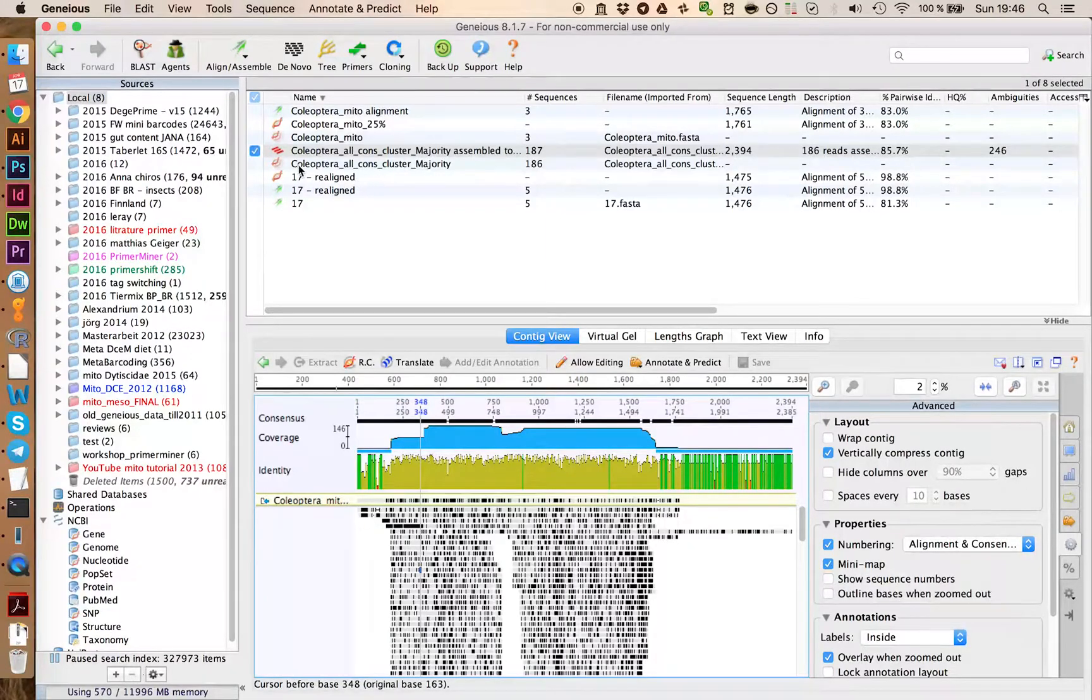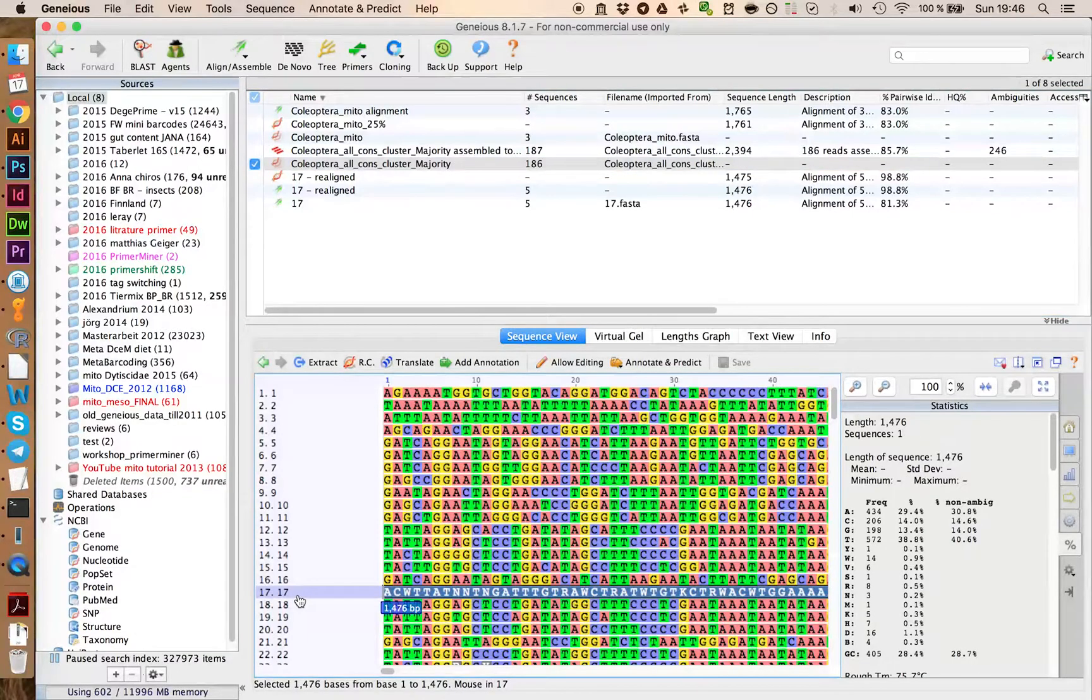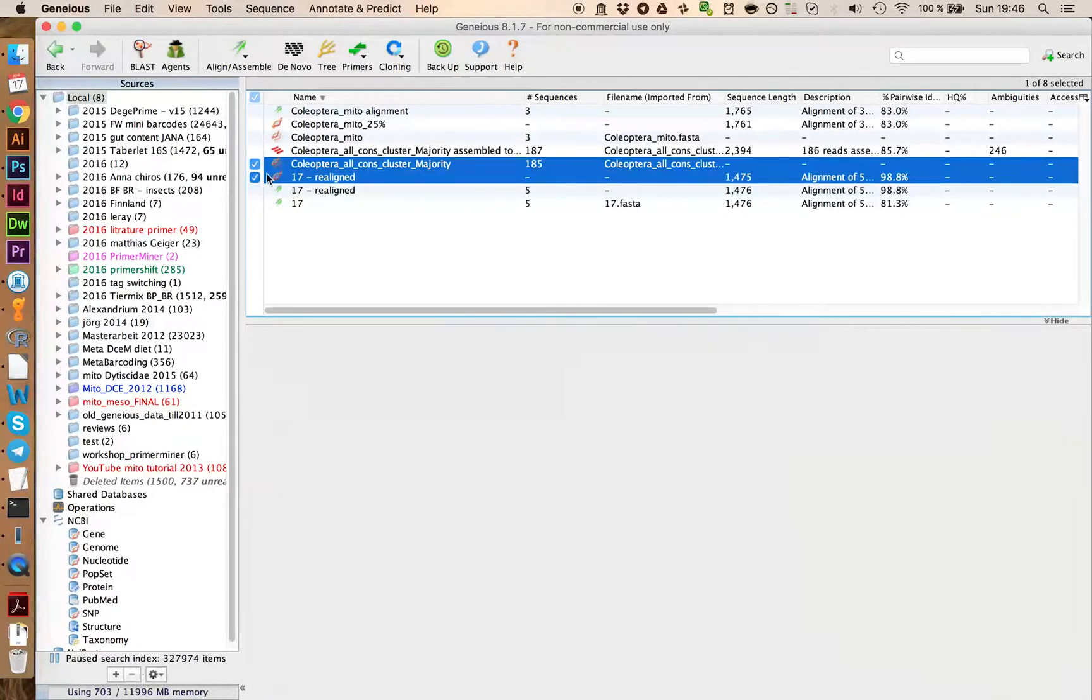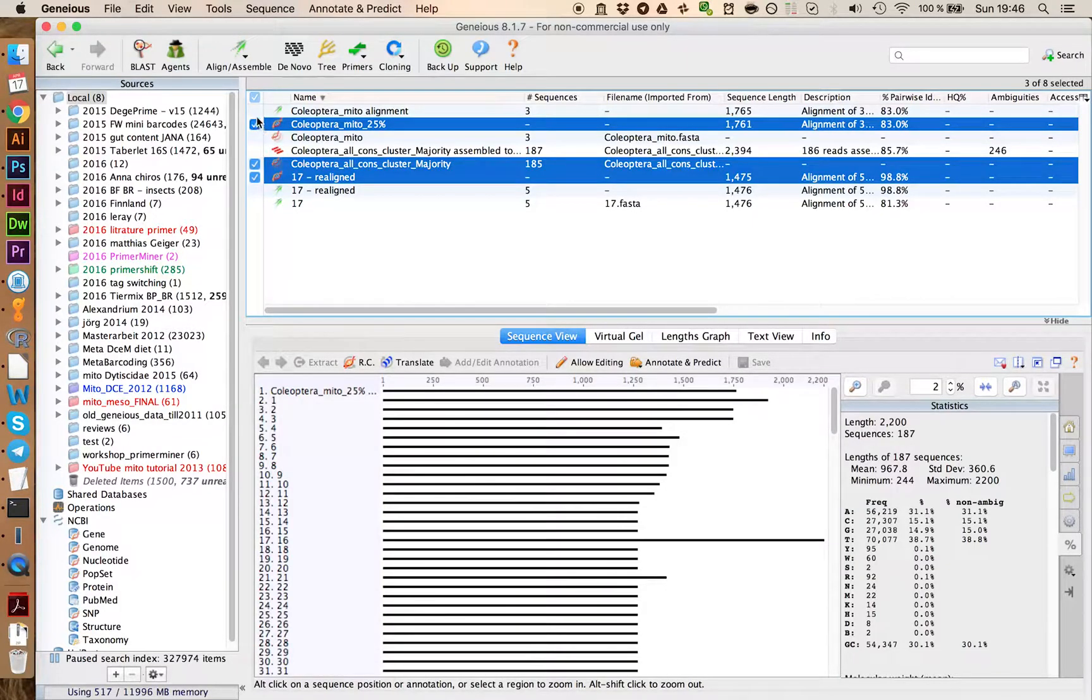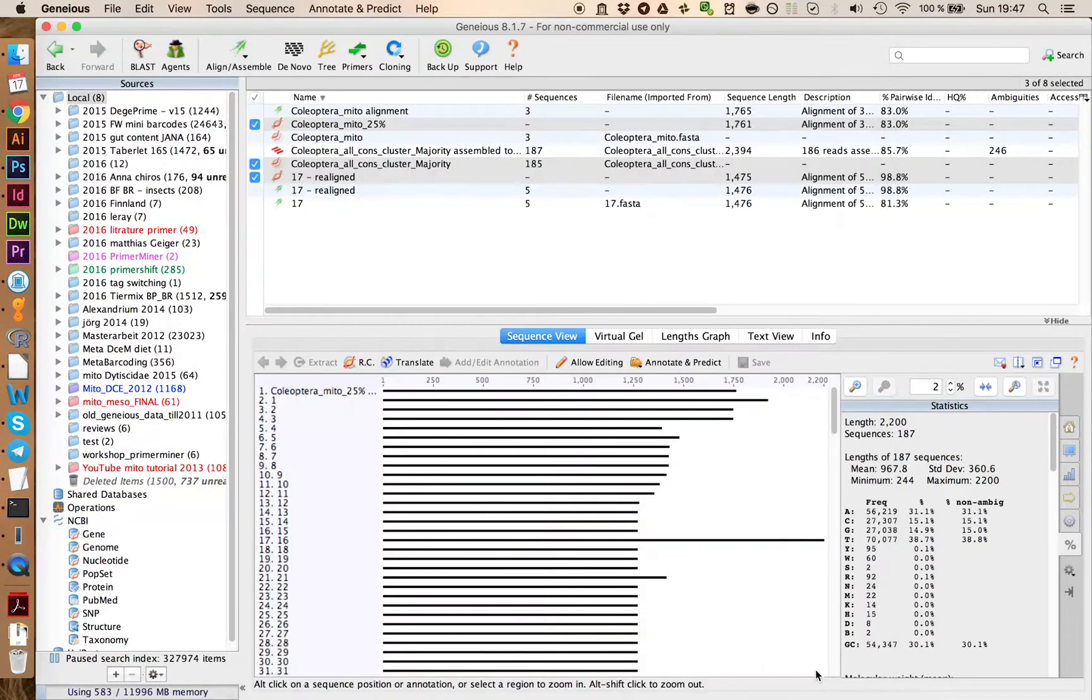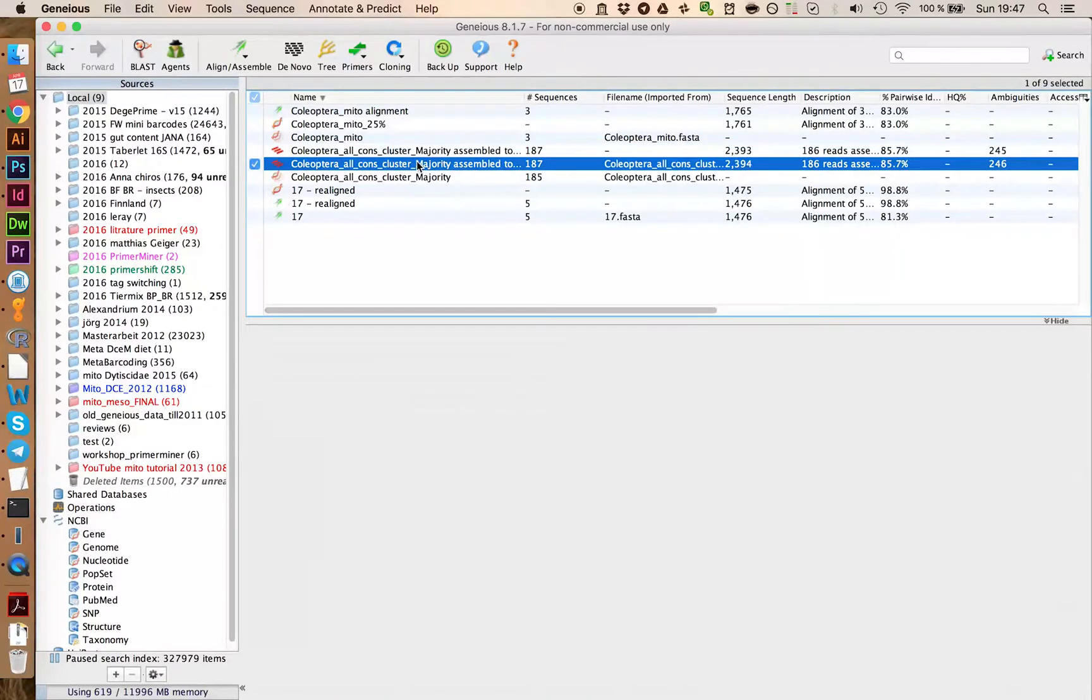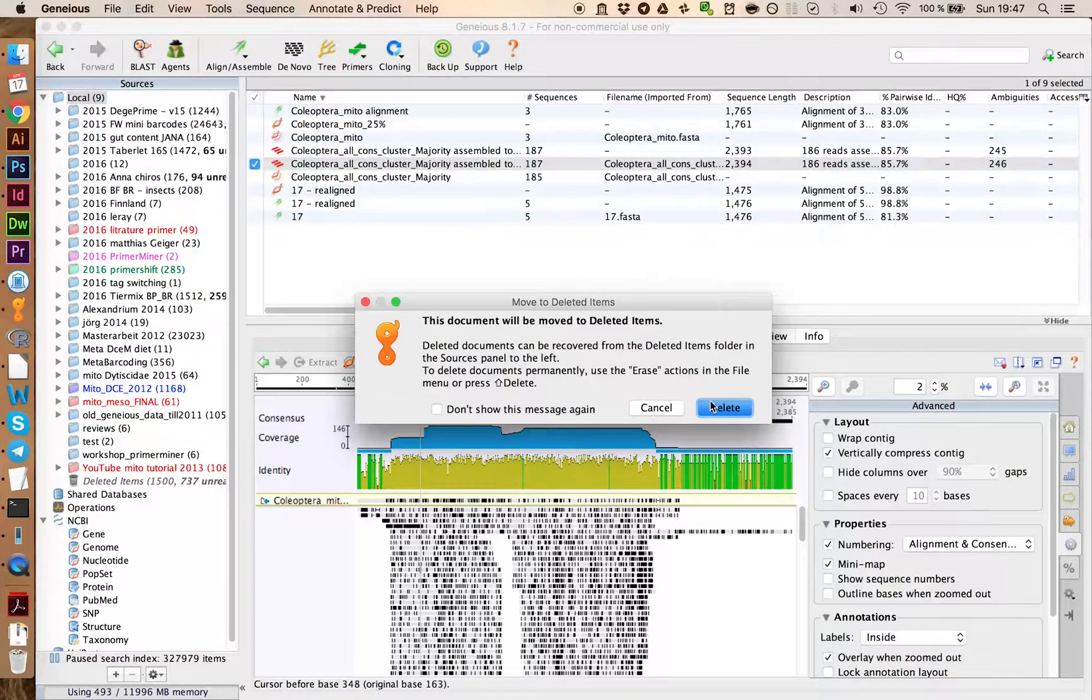Let's quickly make a new alignment. So we're first going to go into the raw data and in here we delete sequence 17, save this one, and then we select the new sequence 17 here and map this against the Coleoptera Mito 25% again. Map to reference with the same settings. We click on OK. And just to have everything clean up a bit, we delete the old file.